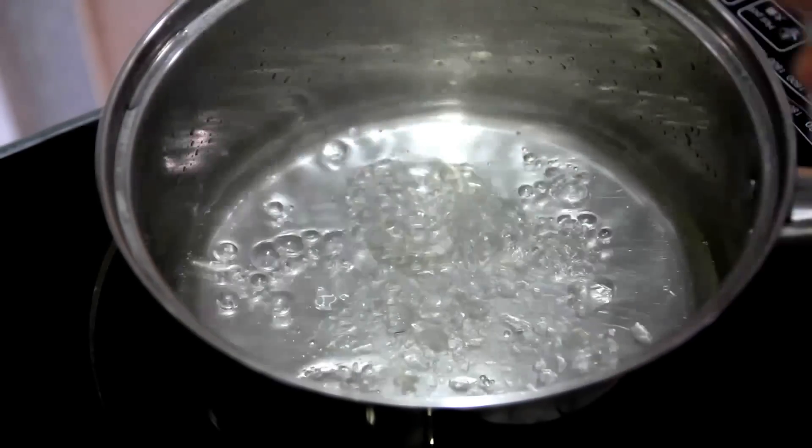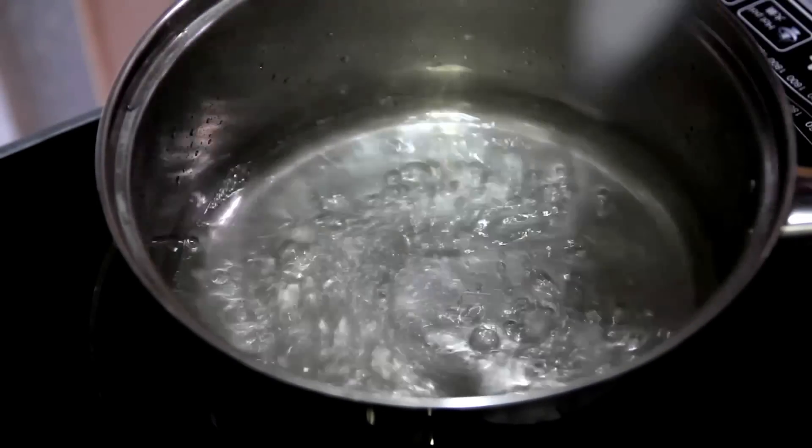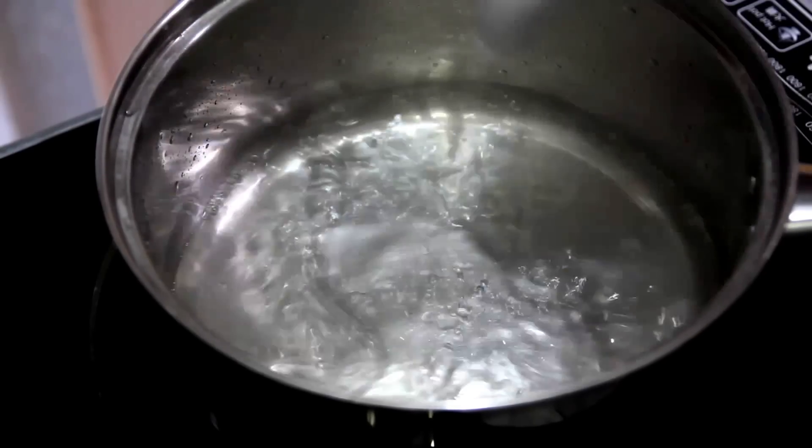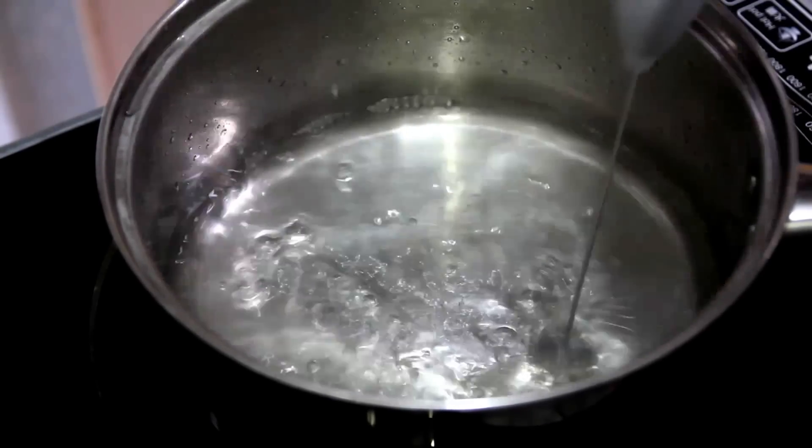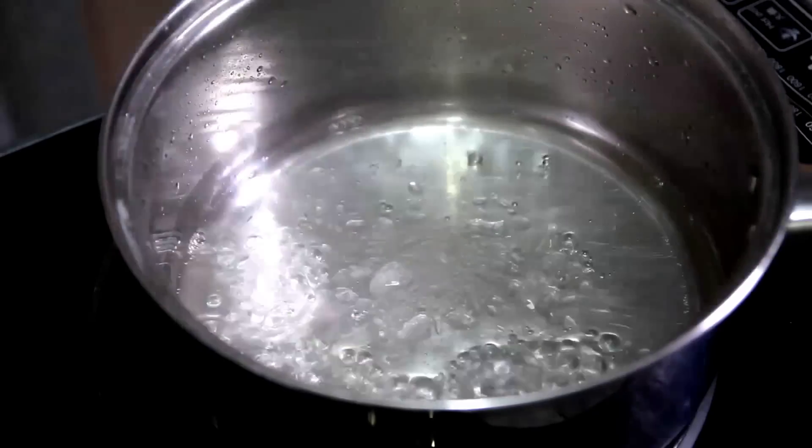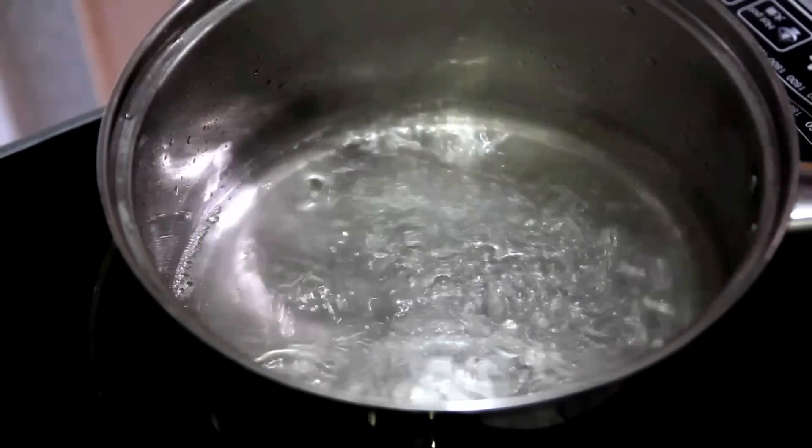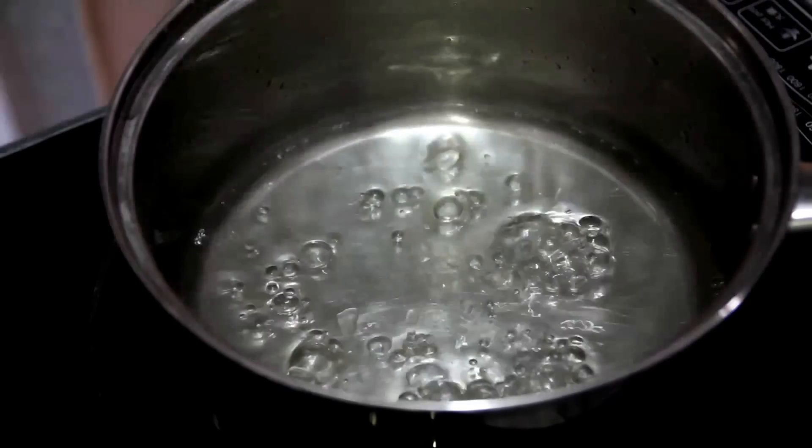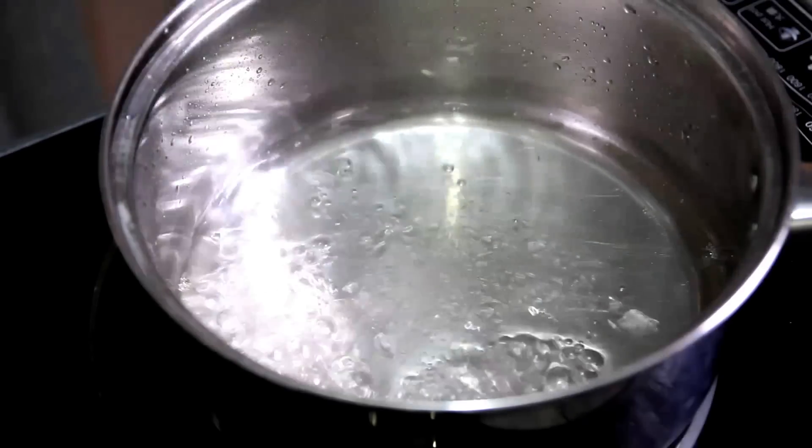Now prepare another saturated alum solution, but this time, boil the water and add alum in the boiling water. Let it dissolve. When all alum is completely dissolved, add alum again until the solution changes to pale yellow or some alum cannot dissolve any more.